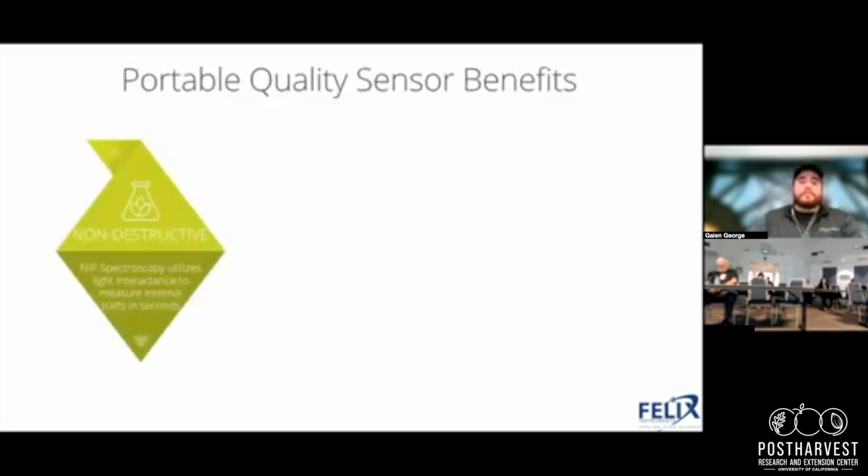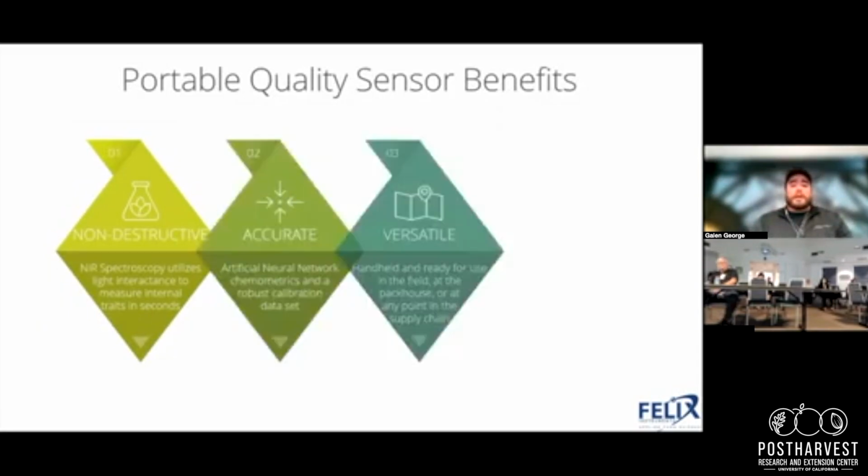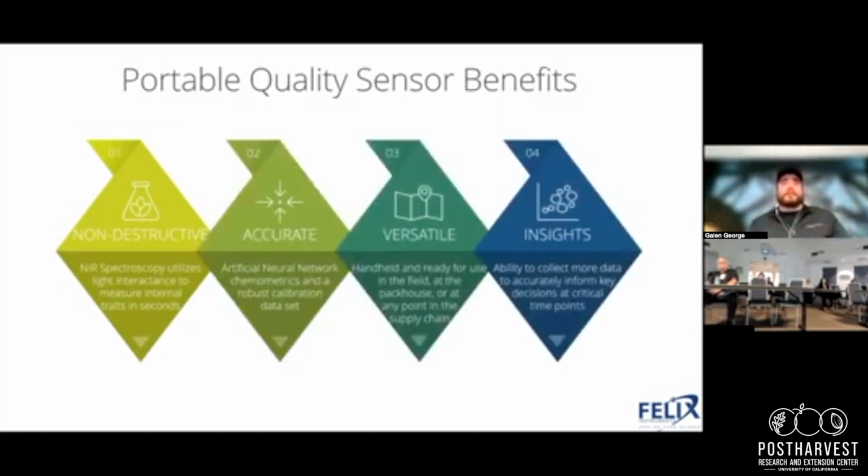Just to talk about some benefits of the portable quality meters. These benefits are similar to the benefits of all the other sensors we're going to talk about today, but specifically with portable quality sensors, the first one is being non-destructive, not having to actually harvest any of the fruit to do any of the assessment. You can do it right on the tree. And post harvest, you can just go through and take scans of all your fruit, not having to worry about sending them to the lab to get destroyed to test for internal traits like brix or dry matter.